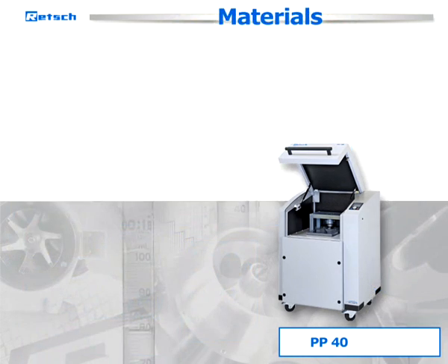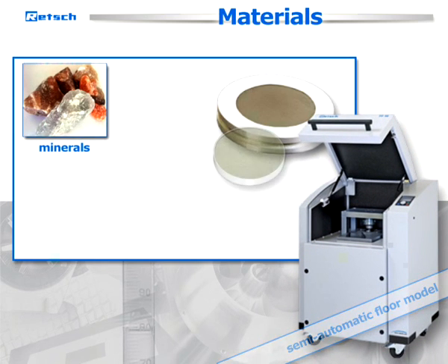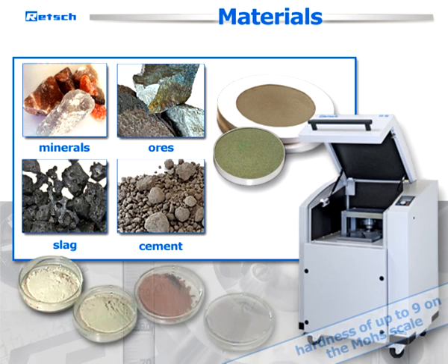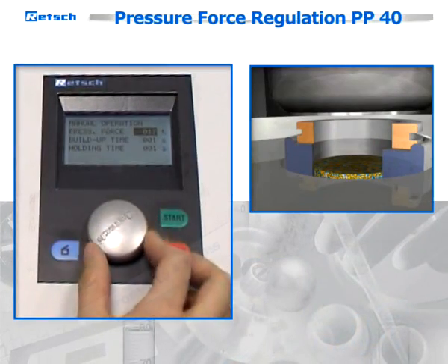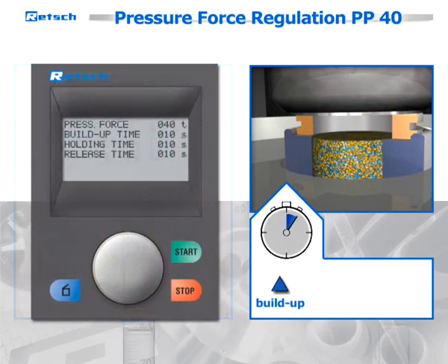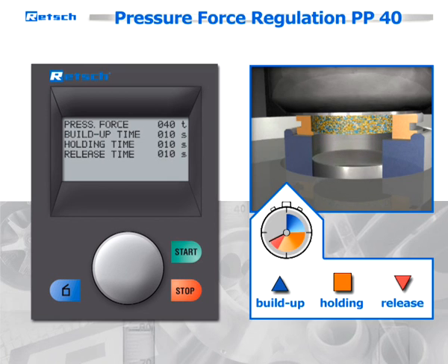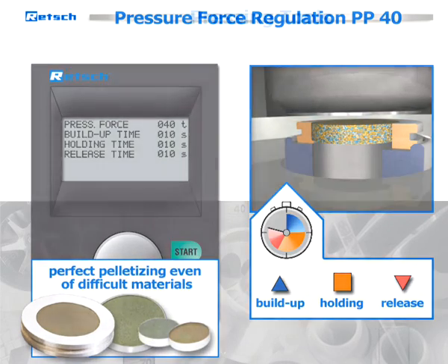The PP40 is a semi-automatic floor model which processes materials like minerals, ores, slag, cement, and many more with a hardness of up to 9 on the Mohs scale. It comes with an individual pressure force regulation from 5 to 40 tons. In addition to controlling the pressure buildup, it also consistently controls the pressure hold and release of force during pressing. This reduces tensions within the sample and allows for the perfect pelletizing even of difficult materials.